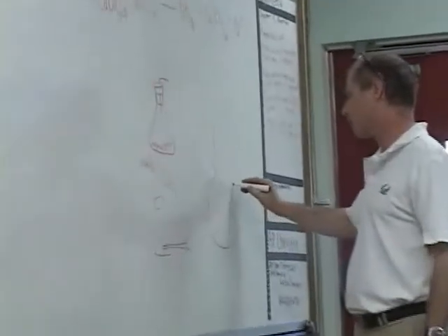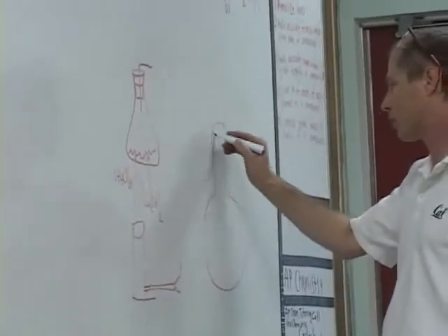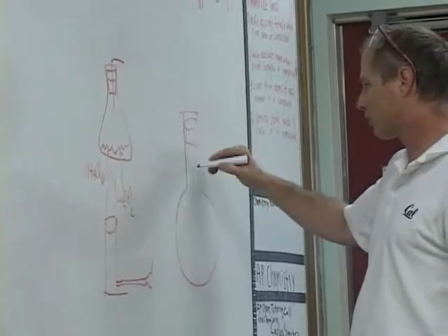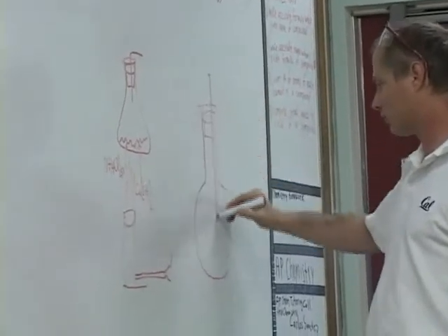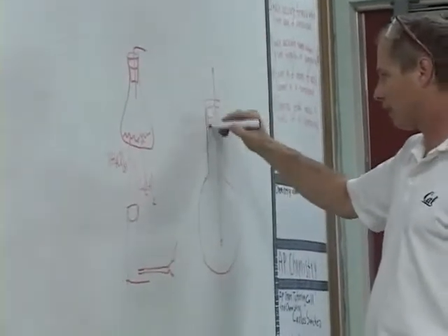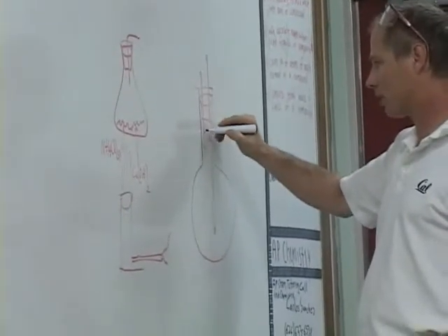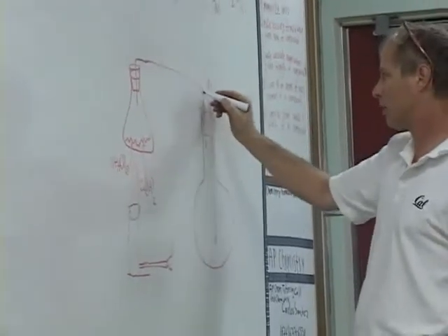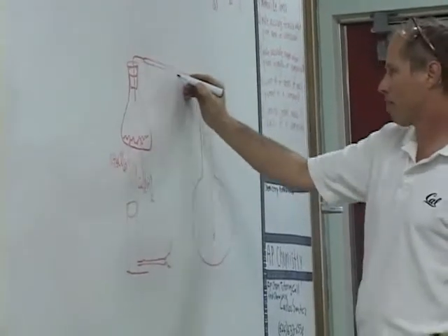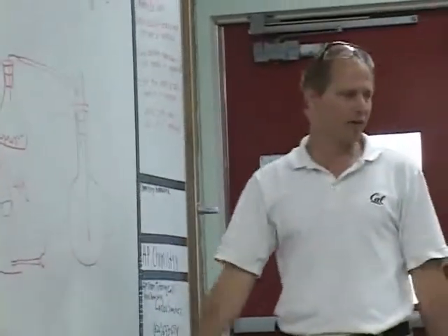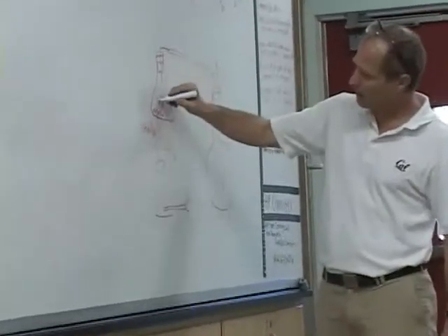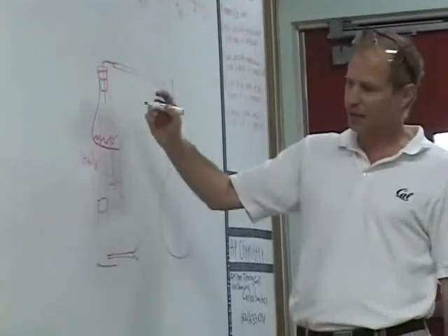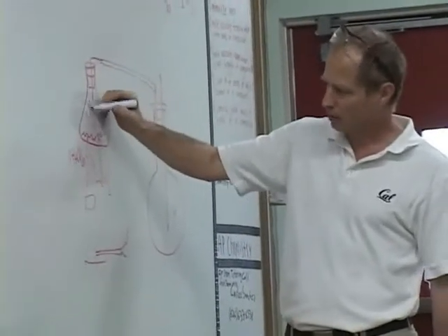Now I'm collecting the ammonia gas for a purpose. This thing is called a Florence flask, and there's a tube going into it — you'll see the purpose of that tube later. What gas is initially inside the Florence flask? Air. Right, we've got air. Then I start heating this and a gas is coming off. What's the identity of that gas? Ammonia.